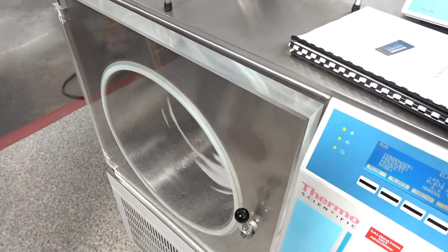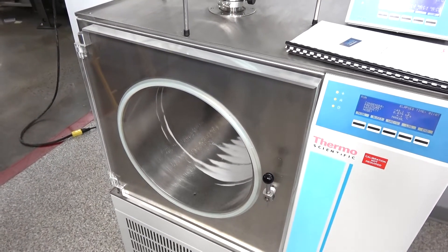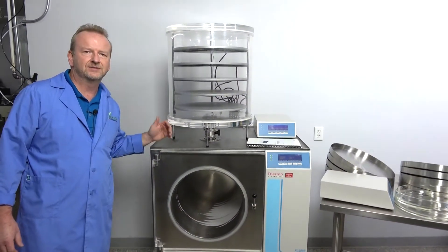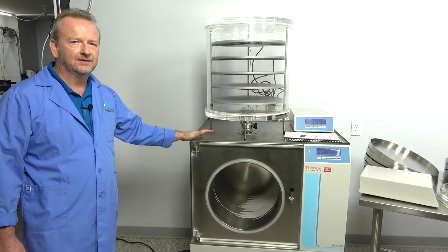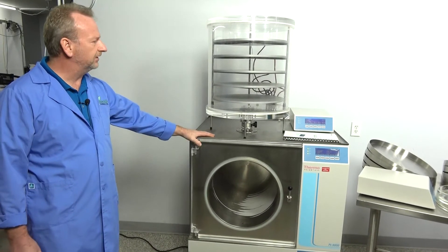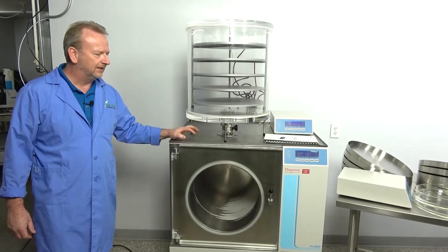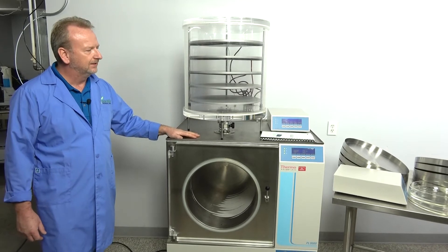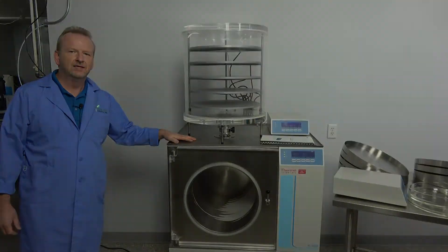The seals are all in great condition. We've thoroughly gone through it and made sure everything is up to our standards. For anybody doing a lot of freeze drying — fruits, anything, even in your labs — this unit is going to work perfect. We've got it set up and running here and it all works great. If you have any questions, give us a call at New Life Scientific. It does come with the scroll pump so there's no oil changes, which is really nice. What you see in the video is what you're getting, and you're getting our support behind it as well. Thanks for joining us.